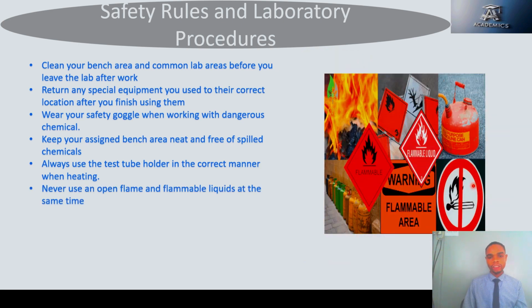Don't bring any flammable liquid close to an open flame, like alcohol. Never heat alcohol directly with an open flame, or electric heater. It can lead to a fire outbreak.